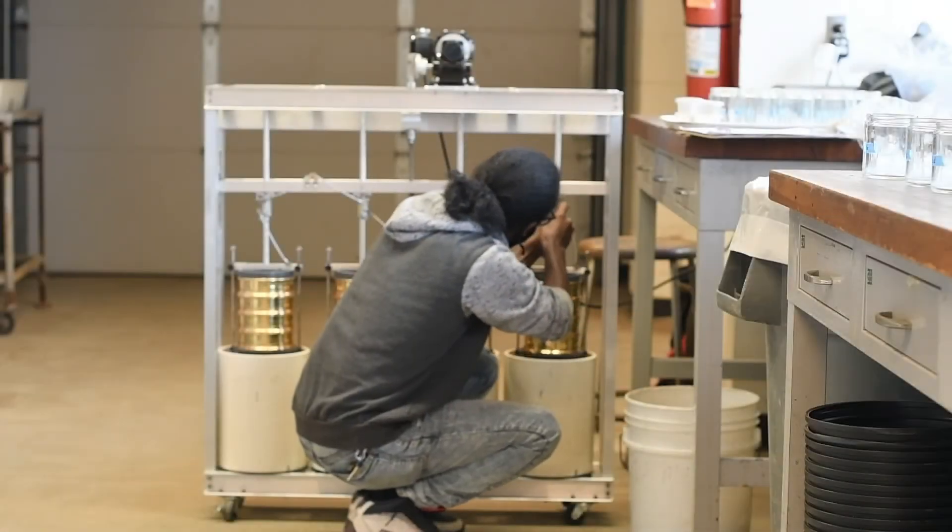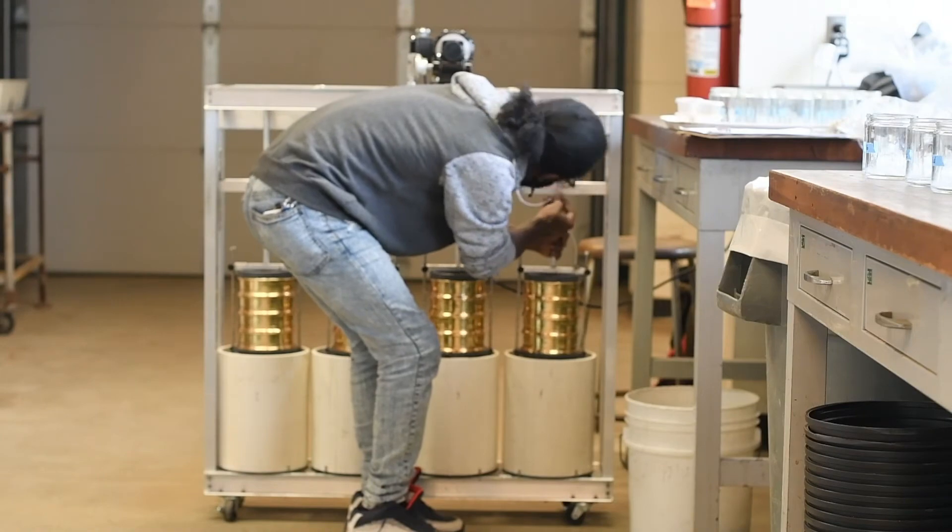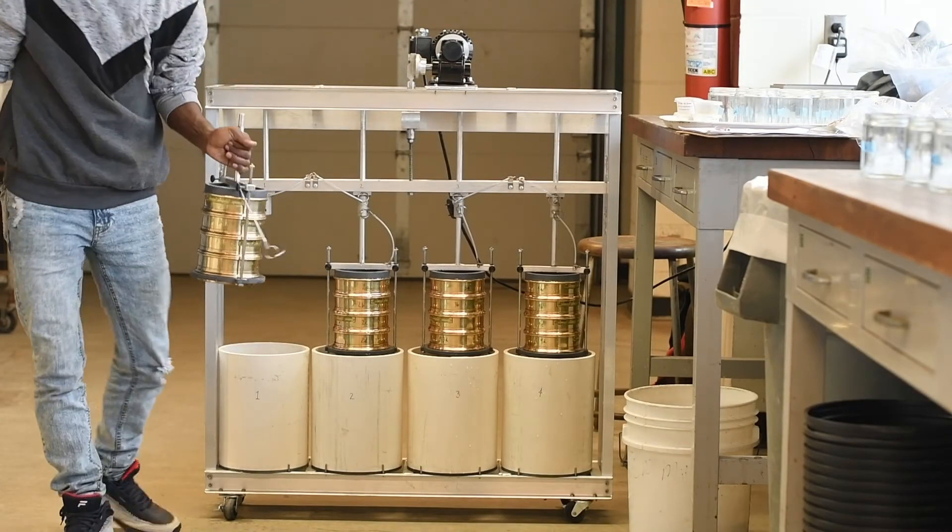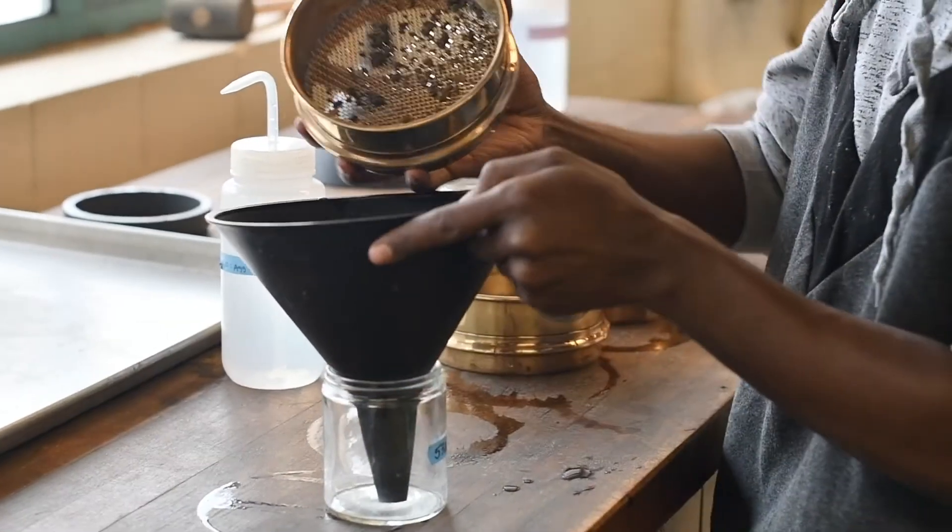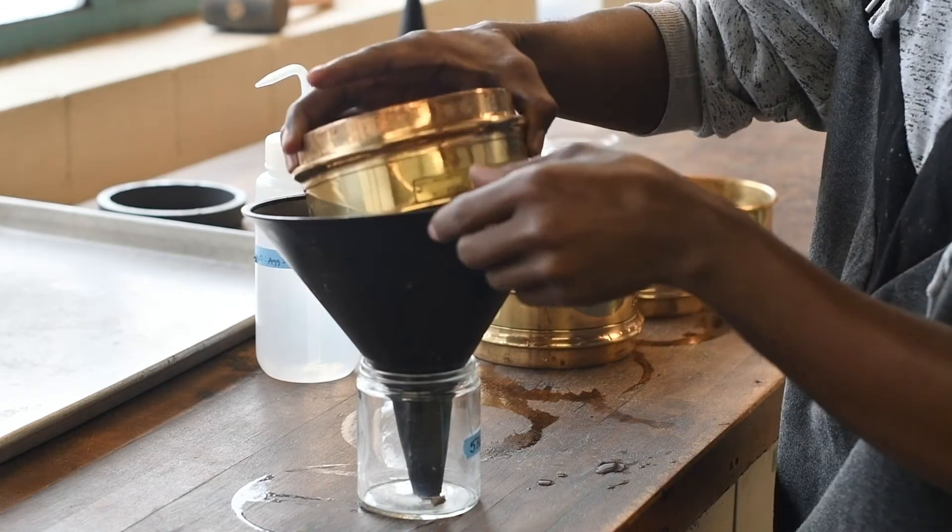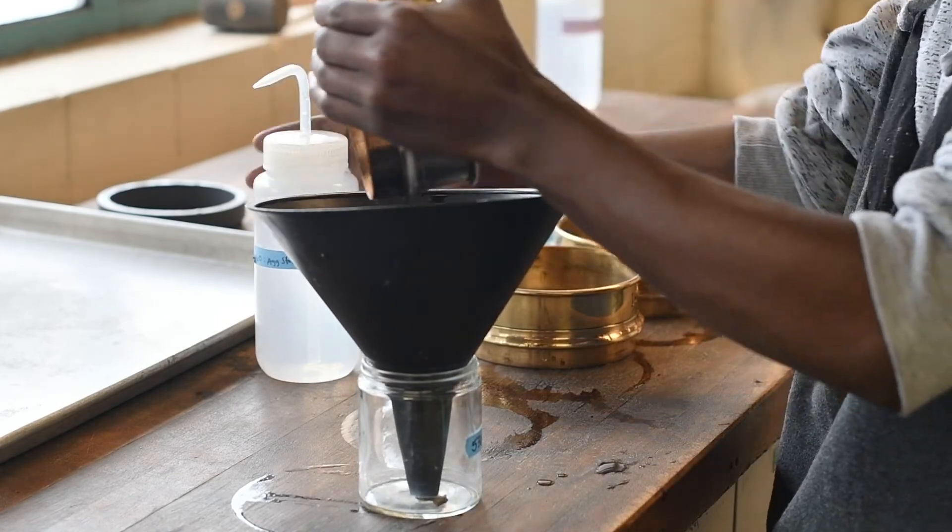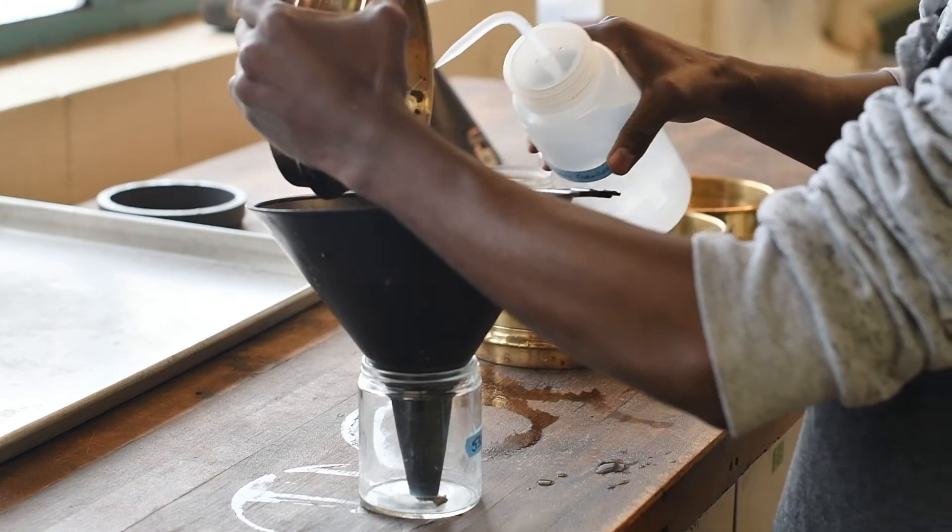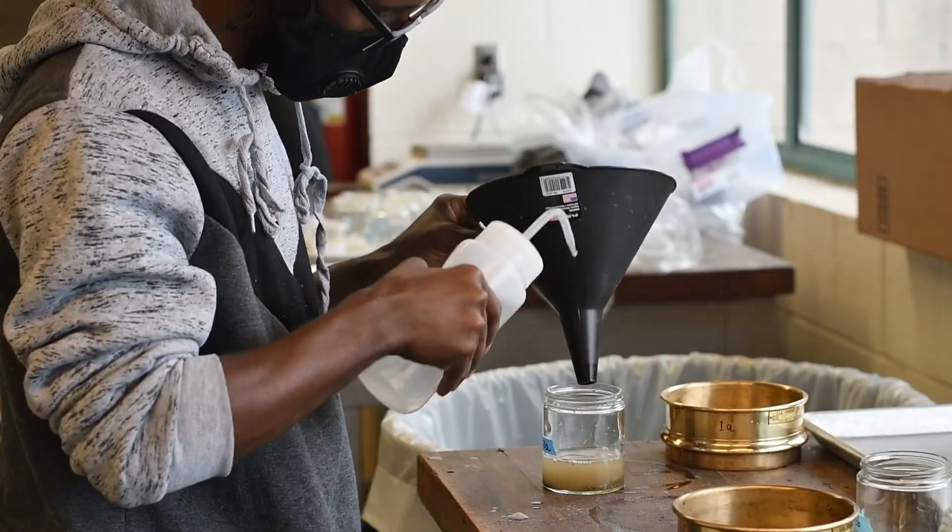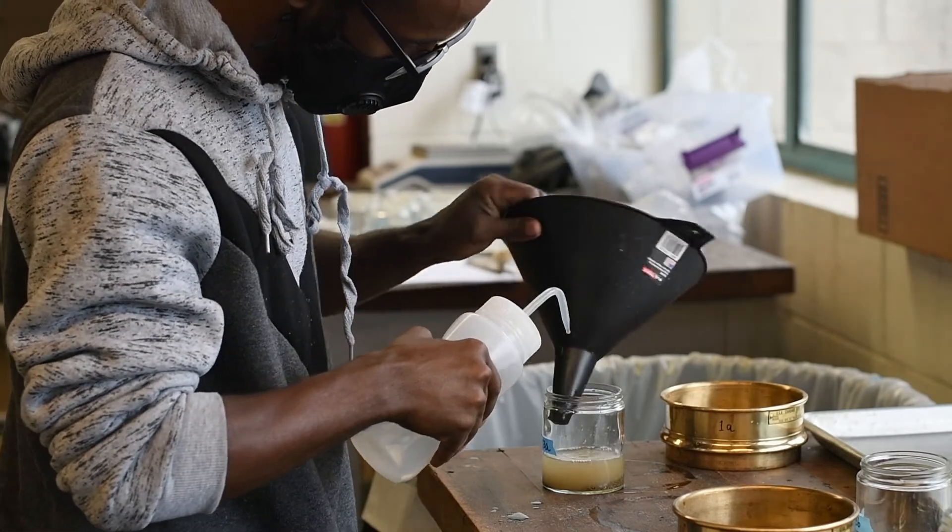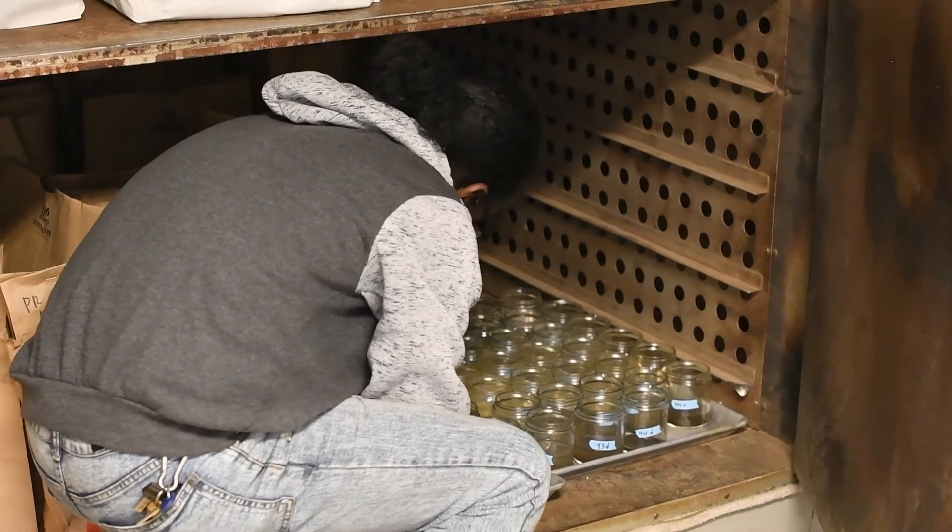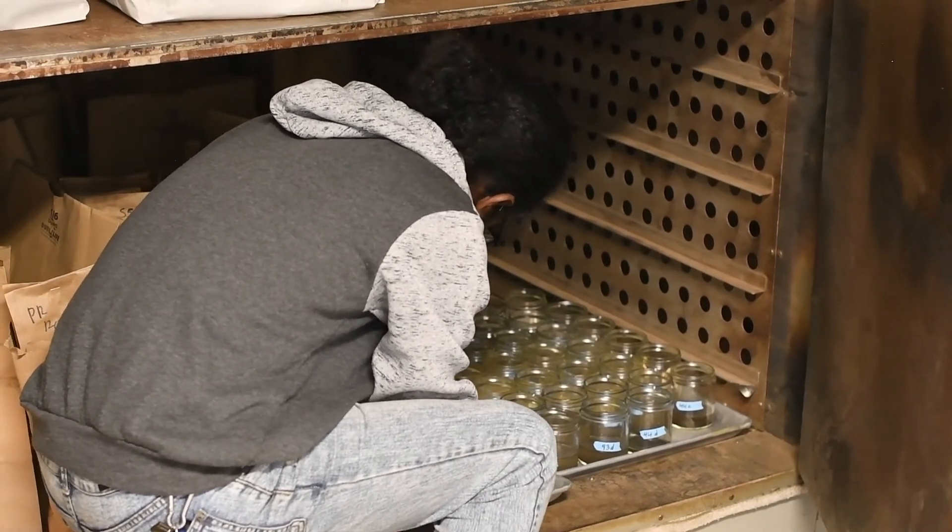When the timer goes off, raise the sieve stacks out of the drums and allow them to drain. Remove one stack at a time and collect the material in each sieve by turning it upside down and tapping it into a funnel over a small glass jar. Make sure you label and weigh the jar ahead of time. Use a wash bottle filled with DI water to collect any remaining material into the jar. Make sure you've properly rinsed any material on the funnel into the jar as well. Then, set the jars in a drying oven until they are completely dry, which may take 24 to 36 hours.